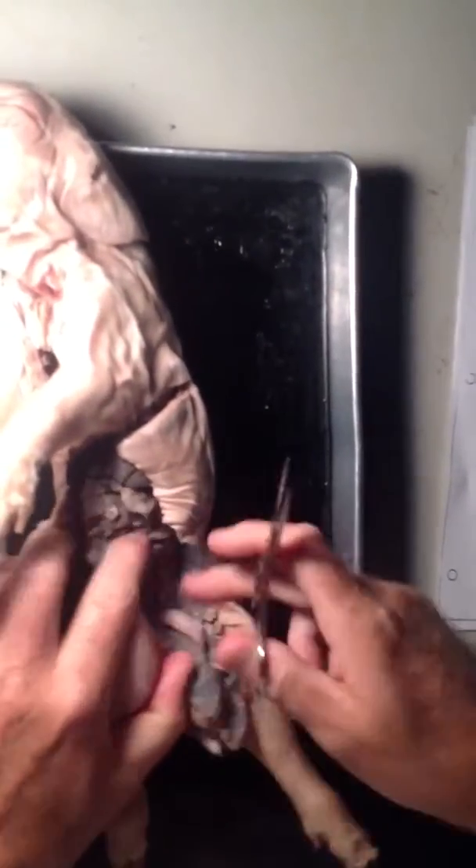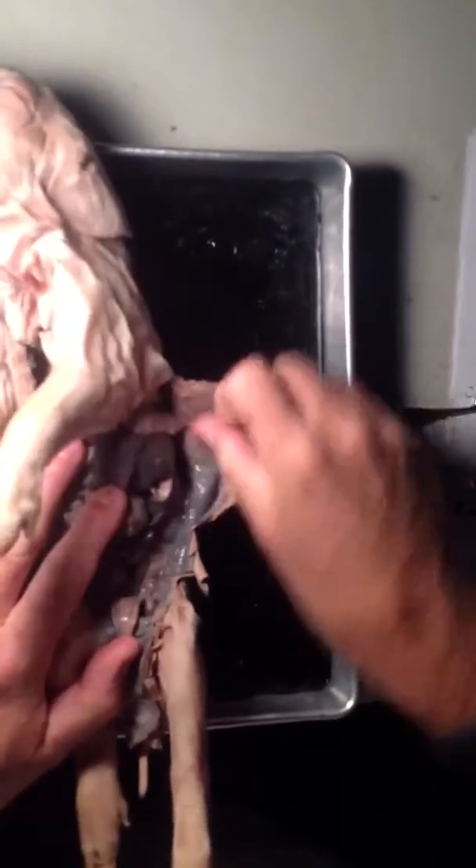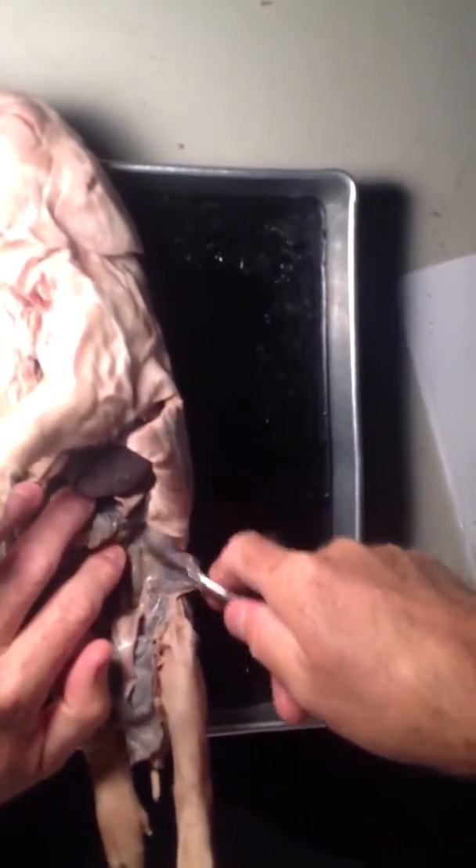So I'm going to cut it down the side. Cut the intestine — oh well, their problem. Break the ribs. Scrape the tissue.